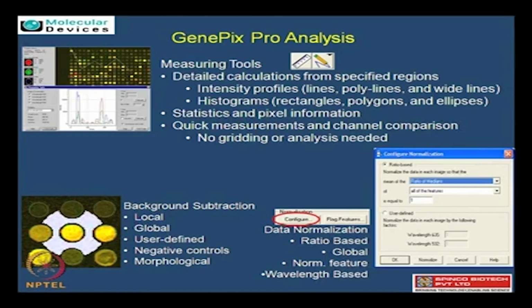Say, for example, you have a positive control, a normal control, and also a shape control, morphologically different ones. You calculate them as features and allow Acuity in the configuration to choose which one to go for. You also have a negative control which gives only the negative background in the same area of defined other types. I guess we discussed the need for these controls, right?